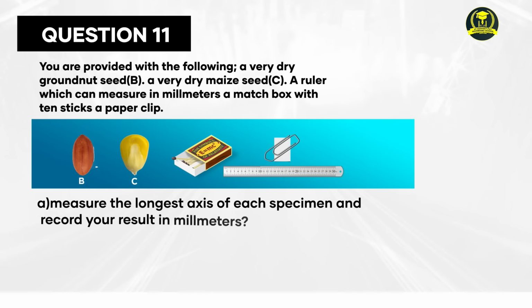Question A. Measure the longest axis of each specimen and record your results in millimeters. By using a ruler, measure the longest axis of each specimen.